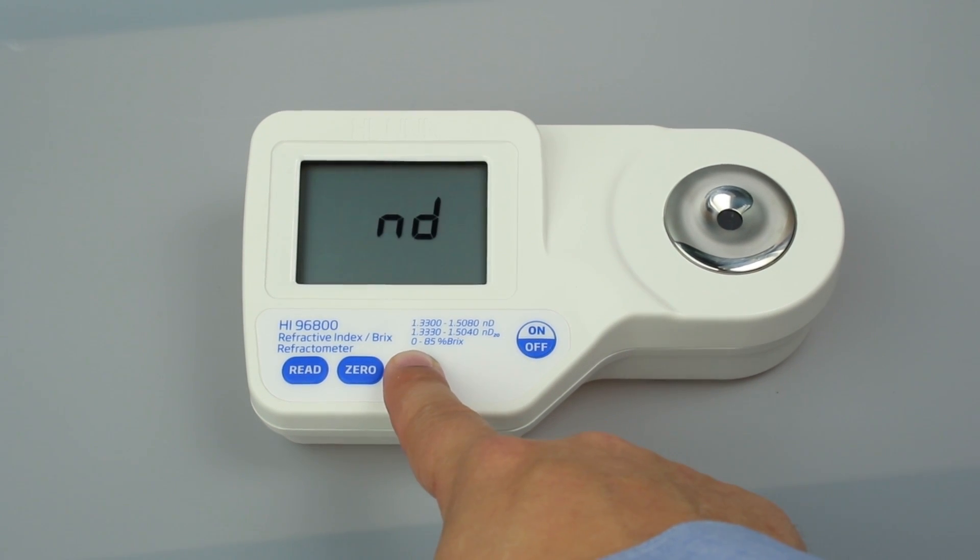Once you have your preferred temperature unit, press the Range key to change the measurement unit. This meter measures in refractive index, temperature compensated refractive index, and percent Brix.